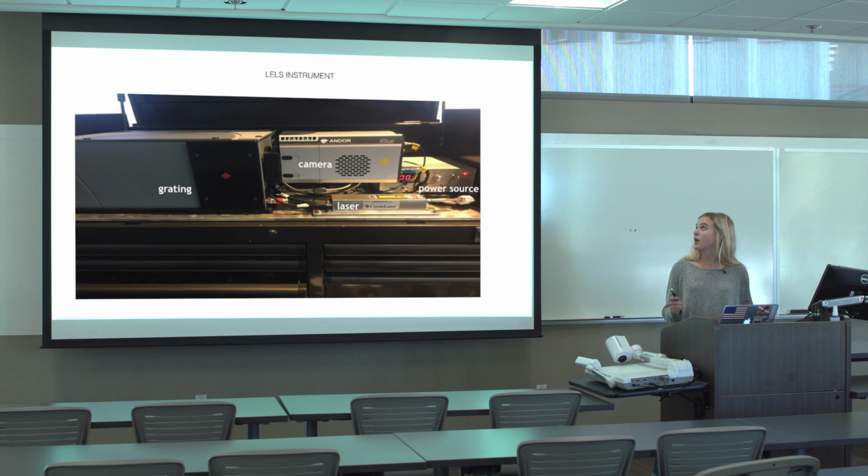So here is our LELS instrument, and we have our laser in the bottom right-hand corner, the power source above it, the camera and the detector, which are very sensitive, and the grating.